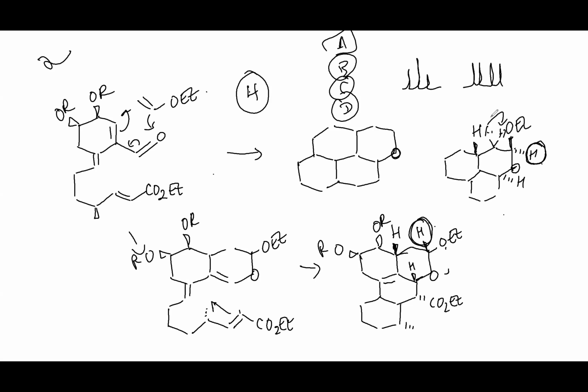These 2 protons weren't equivalent to one another, because it was a ring system. But it just so happened that in one of the diastereomers, the coupling constant between this proton and these 2 was identical, so it would show up as a triplet. In the other diastereomer, they were quite different, so it would show up as a doublet of doublets.